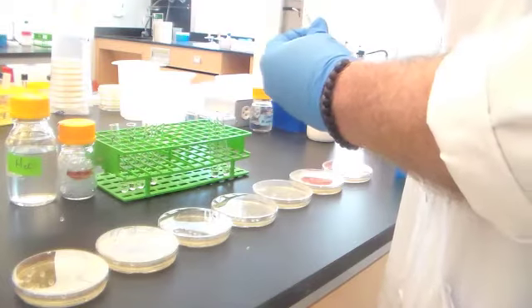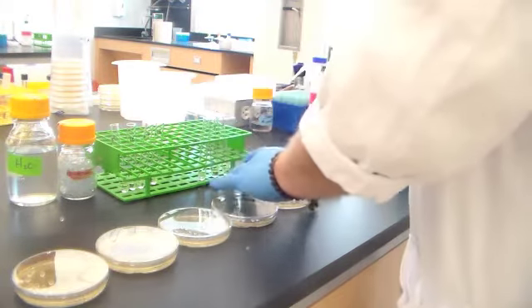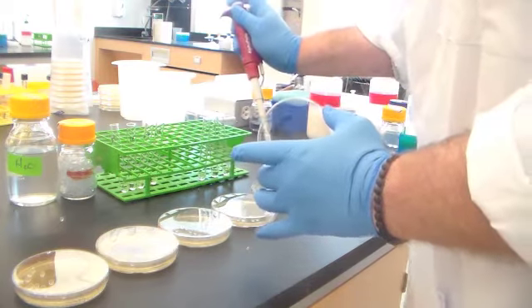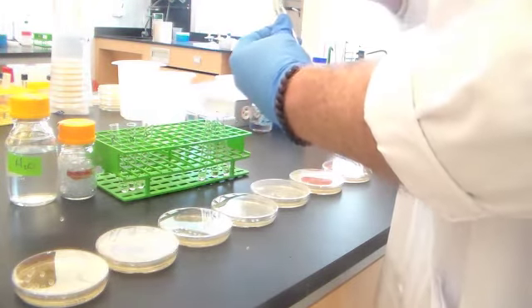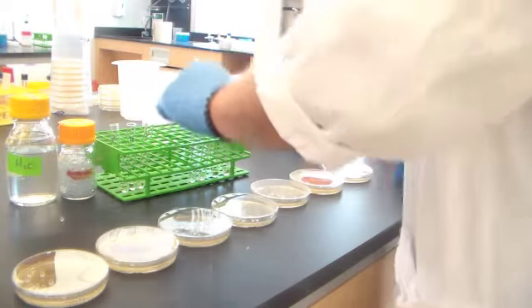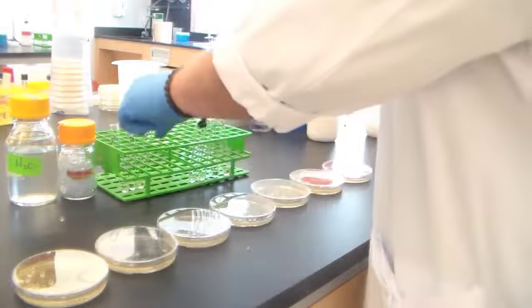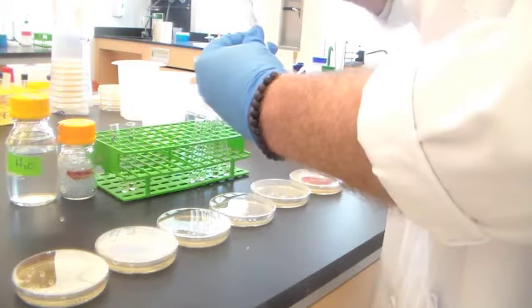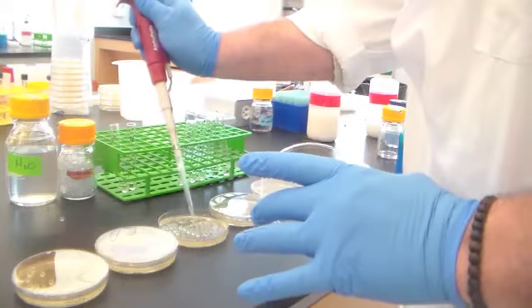We go to 10 to the minus 5. Pull out 100 microliters. Minus 4. Minus 3.